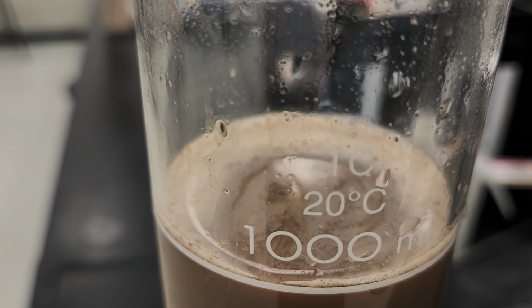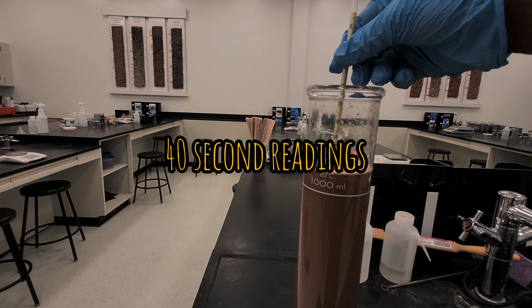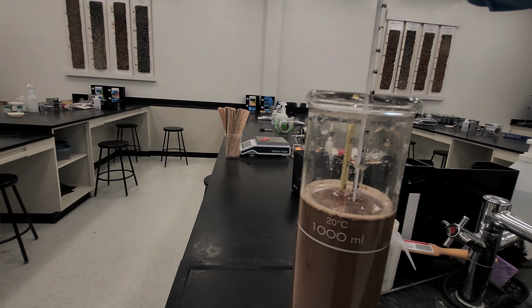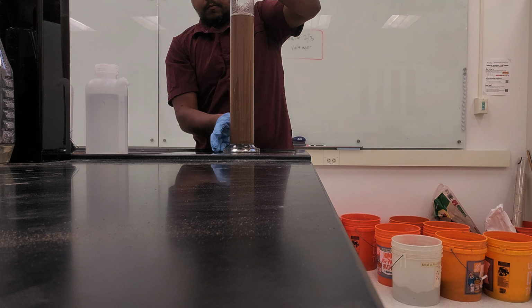After 40 seconds, we need to record the hydrometer reading and temperature reading. Mix it again and take another 40-second reading.